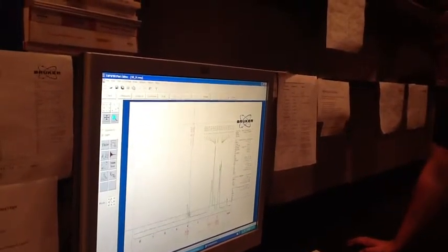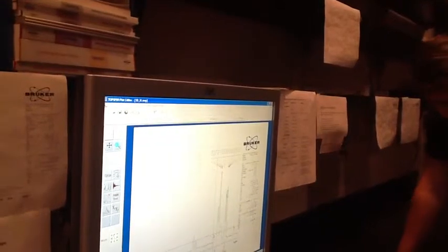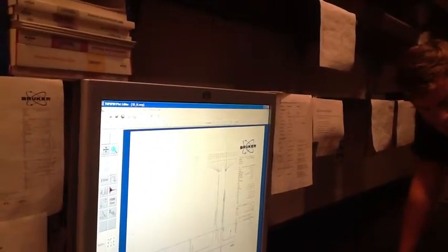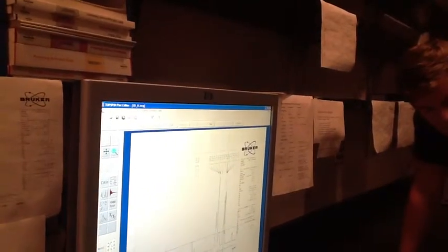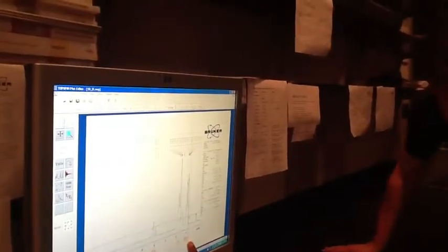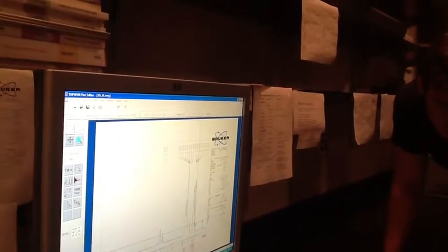The other one has an integration of 0.5, so you have to scale the other integrations to match your molecule, right? So you know that this region will be about 1, and so will this one. One of these integrations has to be 6, the other one will be a triplet and a triplet, right? So here it's saying 3 for that one, and you know it's supposed to be 6, right? And there should be only 1 hydrogen here, and that's supposed to be 1.